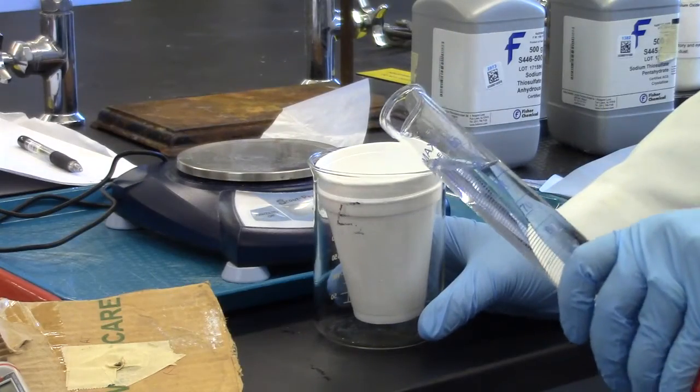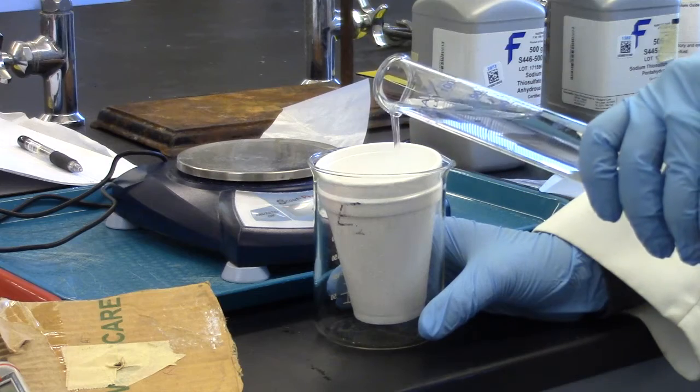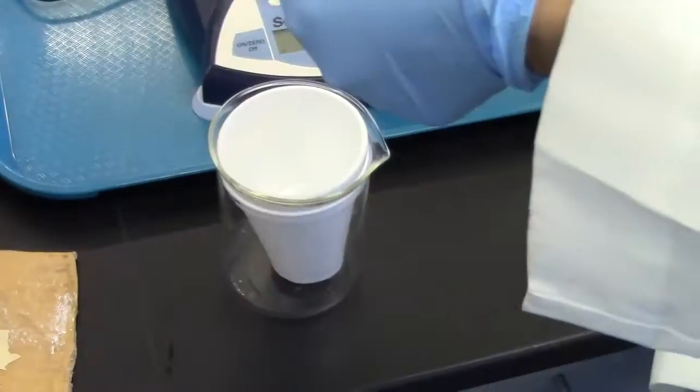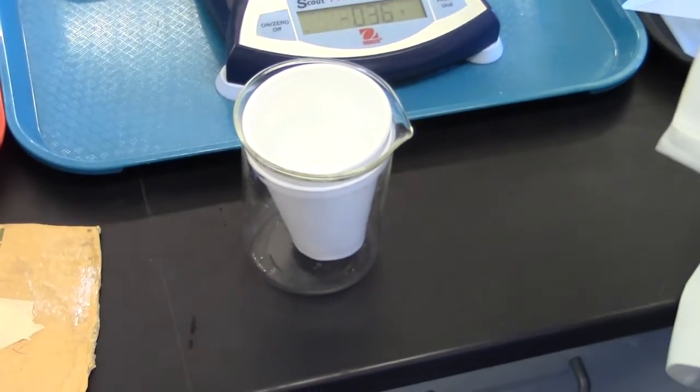Pour hydrochloric acid into calorimeter and take initial temperature. Add magnesium strip to hydrochloric acid.